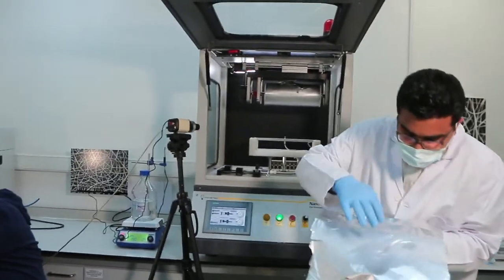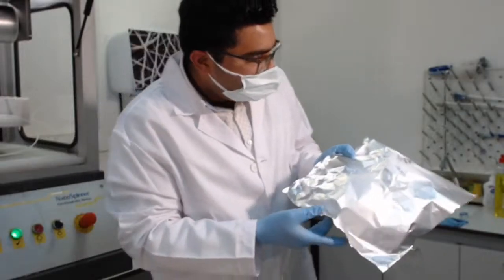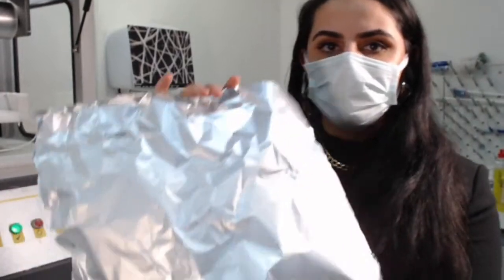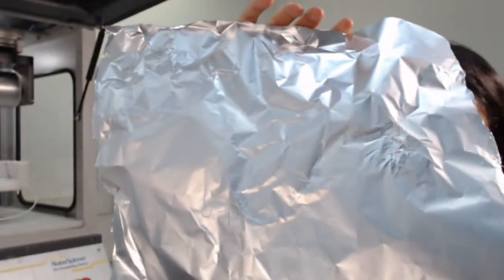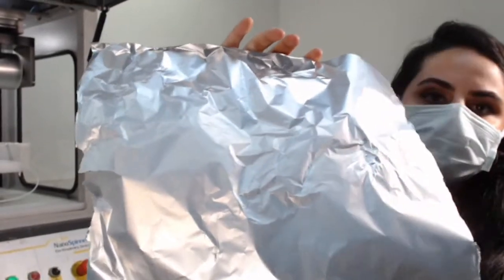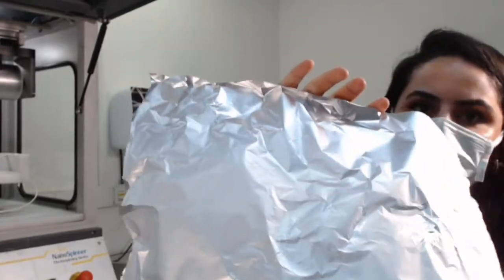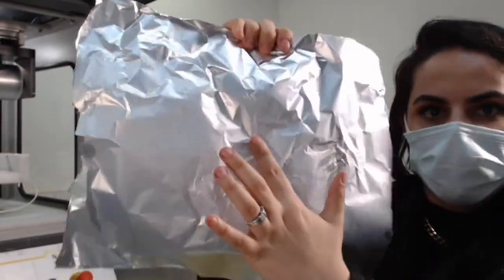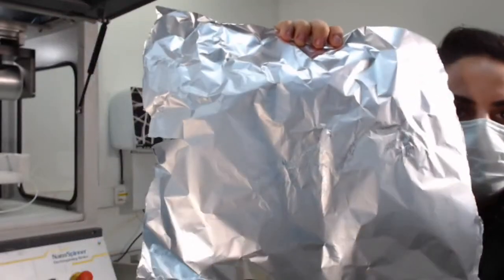Okay. I want to know if you guys are seeing this properly. Okay. Maybe my colleague was ready to. Yes, here you can see a better image. Since we have started the machine only a little while ago, it might not be that obvious, but you can see there is a line here, and you will see it right there.